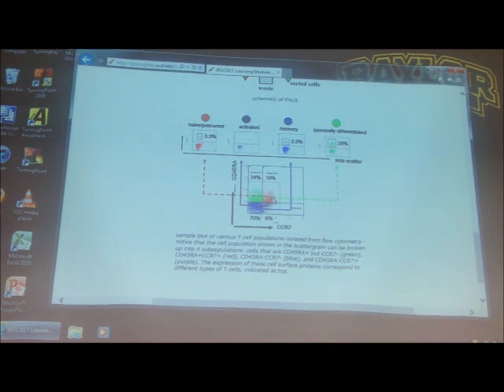And let's say this were really 4 blobs. We'll color this population green. We'll color that population red. We'll color that population some other color. And then this population will be purple, and then we'll color this population blue. And then we'll say this population has very little of either antigen displayed on the surface.